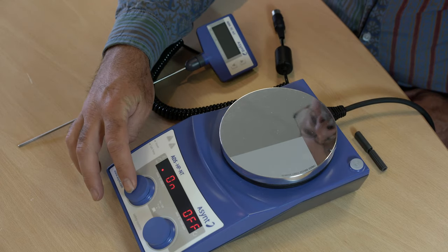That key safety feature is three totally independent heating control circuits, thereby adding three levels of safety. Most people are familiar with the first temperature control — on most hot plates it's a simple knob or control on the front.